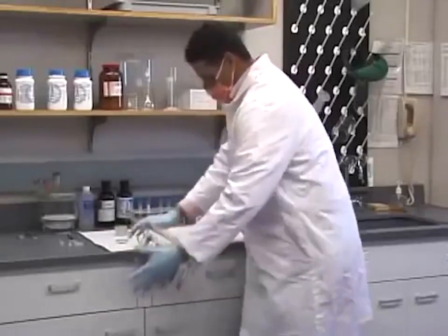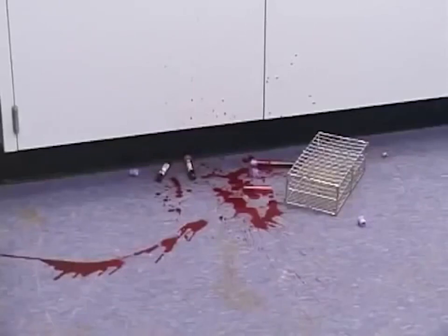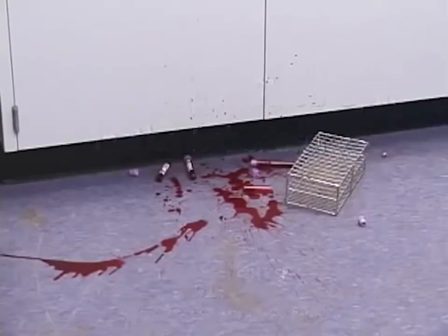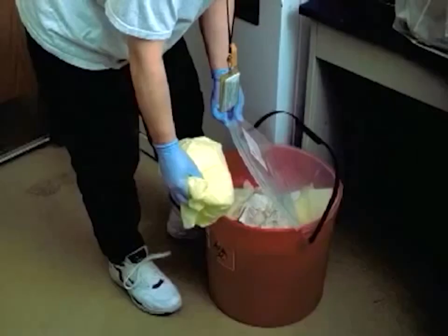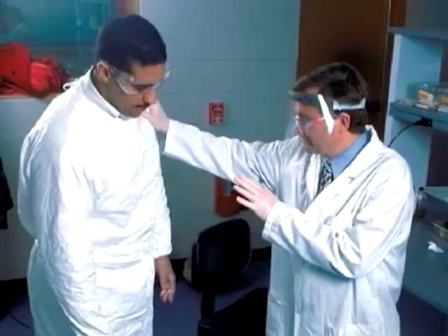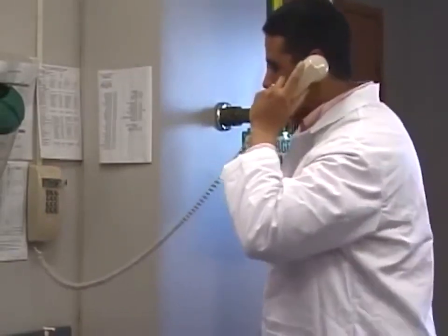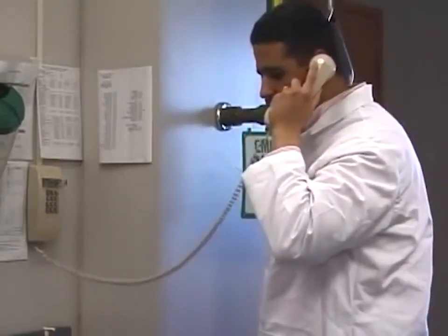Large spills of blood and other potentially infectious materials occasionally occur in laboratories and are typically cleaned up by laboratory personnel. If you should experience a spill of this type, follow the procedures described in this video. If you are splashed with infectious material during a spill, immediately remove all contaminated clothing and dispose of it as biomedical waste or autoclave it. Inform those in close proximity of the spill to leave the area. And if you need assistance with cleanup, call the Office of Environmental Health and Safety.